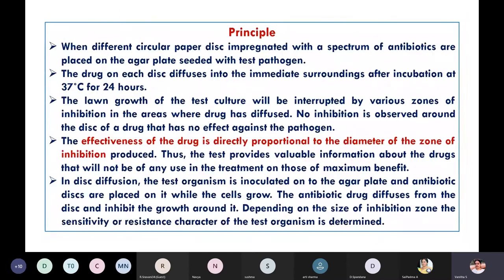Coming to the principle of this experiment: different circular paper discs impregnated with a spectrum of antibiotics are placed on the agar plate which is seeded with the test pathogen. The drug on each disc will diffuse into the immediate surroundings after incubation at 37 degrees centigrade for 24 hours. The lawn growth of the test culture will be interrupted by various zones of inhibition in the areas where the drug has diffused.